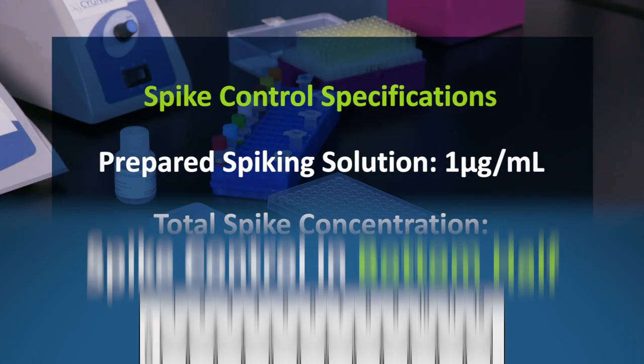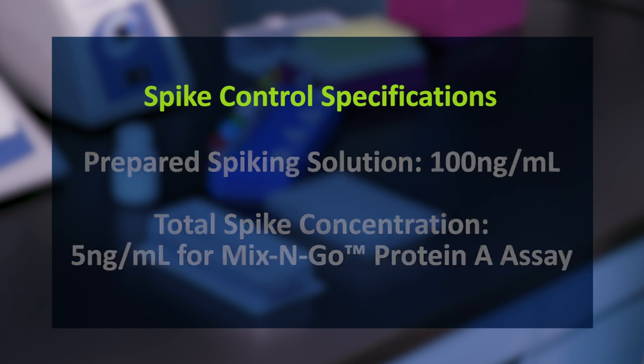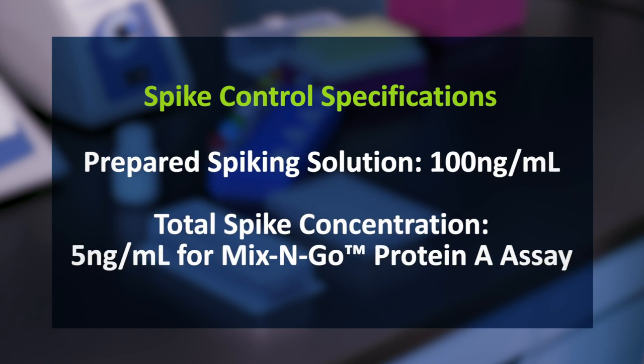For this assay, spiking solution has already been prepared to one microgram per milliliter. This has been done so that when 10 microliters are spiked into 190 microliters, the total spike concentration is 50 nanograms per milliliter. These numbers work best for an ELISA that goes to 100 nanograms per milliliter. For a mix-and-go protein A assay, the target numbers would be 5 nanograms per milliliter.